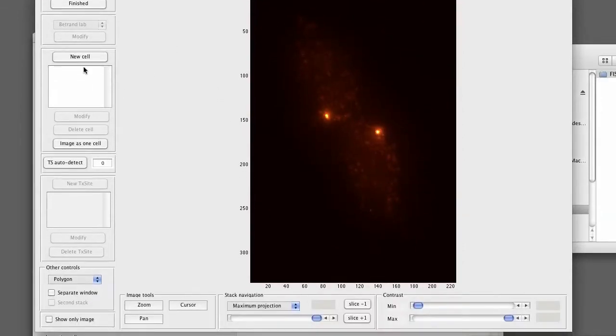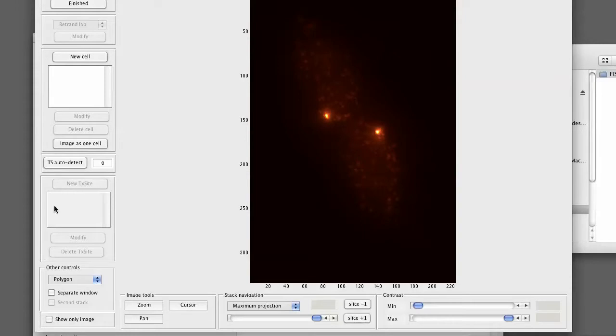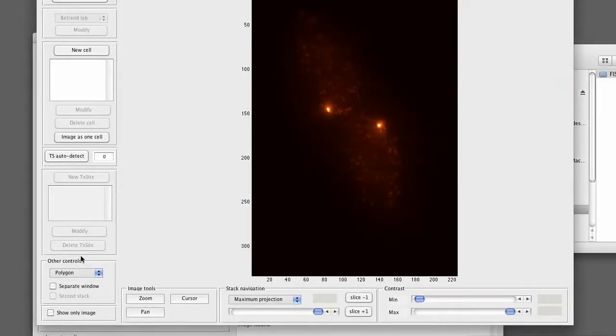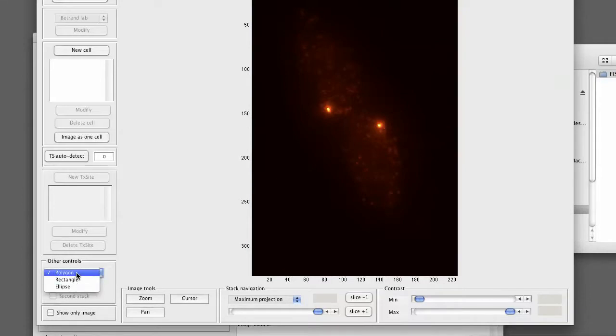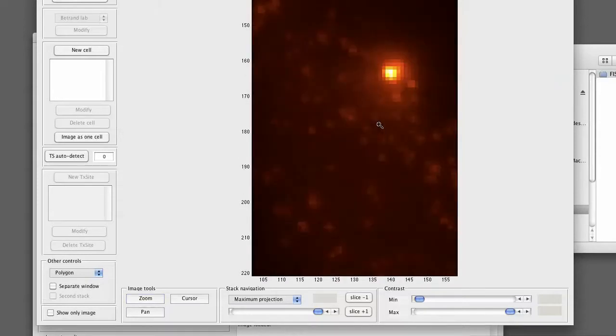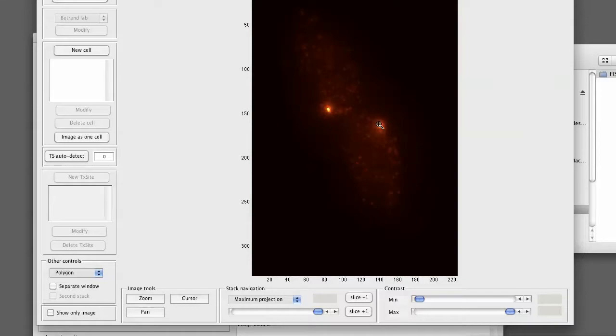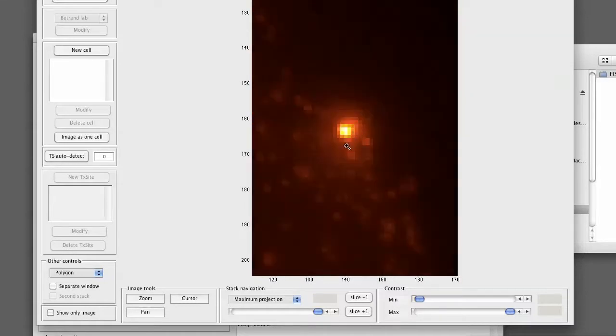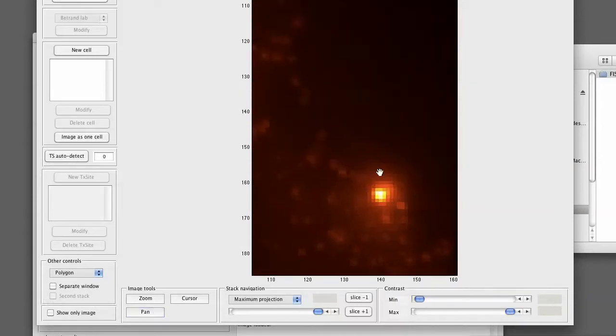As soon as we defined all the cells, we can define the transcription site. This can either be done automatically based on an intensity value or we define them manually as we did it for the cells by the same controls but not for the transcription sites. With a few other things we can specify. Interesting is the option to define different geometries. So we can define cells and transcription sites either as polygons, rectangles, or ellipses. We can also zoom into an image by selecting the zoom from the image tools. Click on the image. To zoom out, press shift and click. When we are zoomed in, we can use the pan tool to move around.